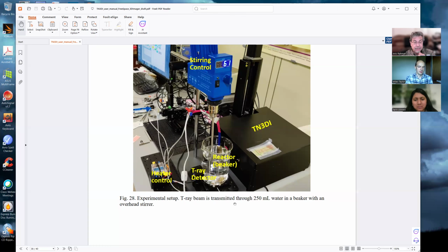What's the point? The point is, if I put a tablet in this simulated stomach fluid, then I can measure how long it takes to dissolve. That is important because the dose and all of those things depend on how fast it's dissolving. Is it a one-step or two-step process? Some tablets have a coating and dissolve slowly. All of those things can be characterized by this experiment.